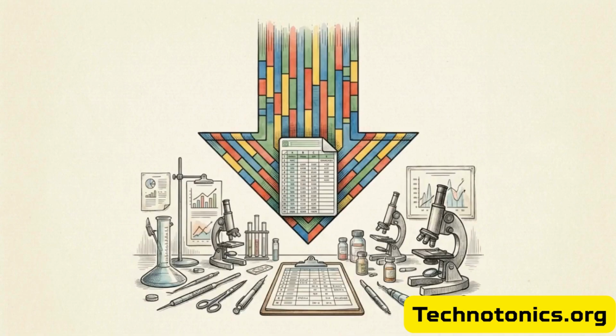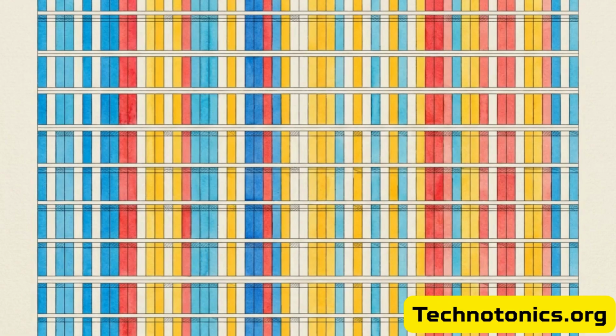Once the process is complete, download the output and open it in a viewer like JALView or Mega. Your alignment is now visible as a structured, color-coded grid. Here, vertically stacked sequences with matching data share the same background colors.